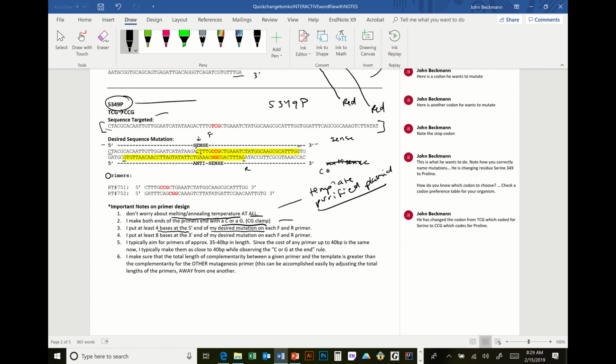And when you do the QuikChange, you want it as close to 4 but not less as possible. You don't want this primer extending further and further to the left because you want these overhangs as big as possible. Those are going to create the sticky ends where this thing matches itself. Okay, so here on this side, here was the rationale. He went 1, 2, 3. I could end with that C, but then I'm not 4 base pairs to the 5' end of my reverse primer, so I got to go further. But if I stop here, I'm not obeying CG clamp, so he goes further, further, further to this G, and that's the rationale of how he picked that.